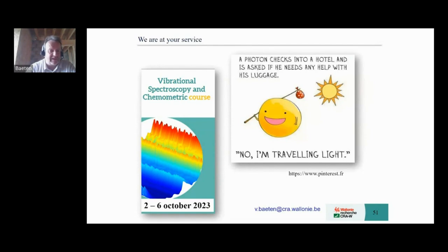There are a lot of very nice instruments, but you need to think in addition to the instrument. You need firstly to measure properly. The way you present the samples to the spectrometer is very important, because we are looking at the interaction between the light and the matter. So if you are wrong in that way, you will have a wrong spectra, and then all that you will do will be lost, because you will not be able to use it properly. So all the procedures exist, and the manufacturers know exactly how to measure, so this is a very important point.